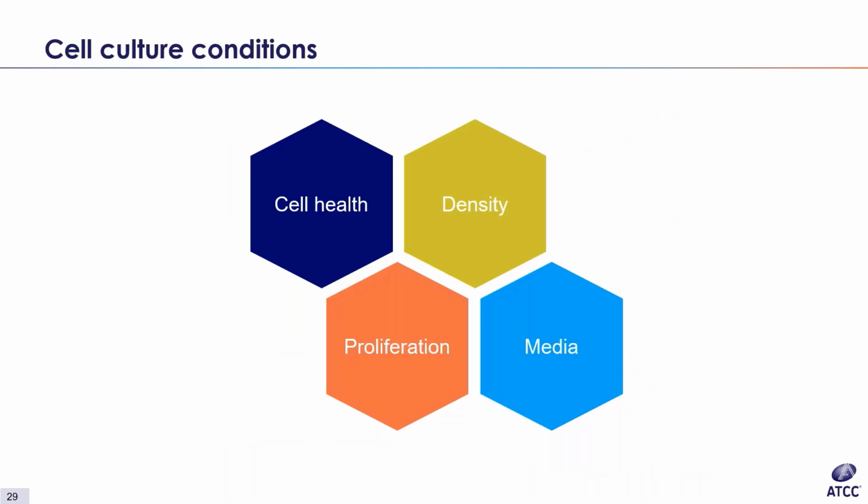So now we're going to talk about transfection best practices and how to optimize culture conditions. These are four things to take into consideration. Even though it is a fairly straightforward protocol, there are several aspects of the process that you need to optimize to ensure the highest possible transfection efficiency. To achieve a good transfection, the health of your cells is of utmost importance. The cells should preferably be at a low passage number. If they're seeded at too high or too low a density, the metabolic rate could be negatively affected, and cells could find the complex toxic or may not readily express the gene product of interest.